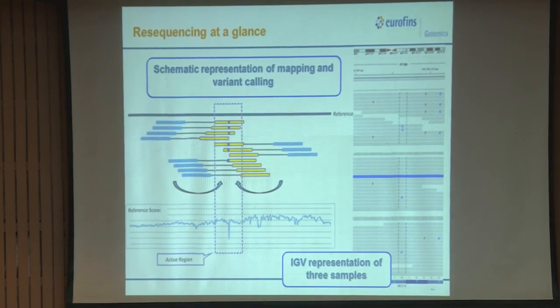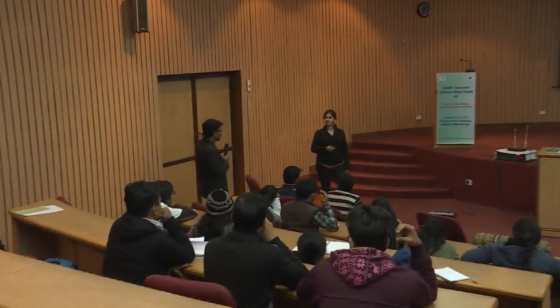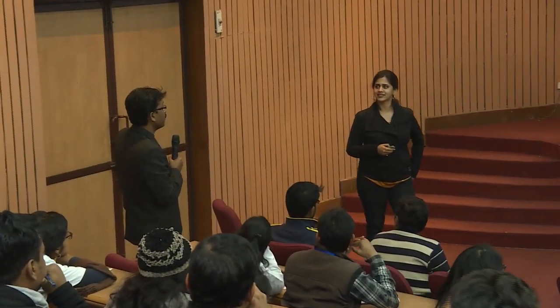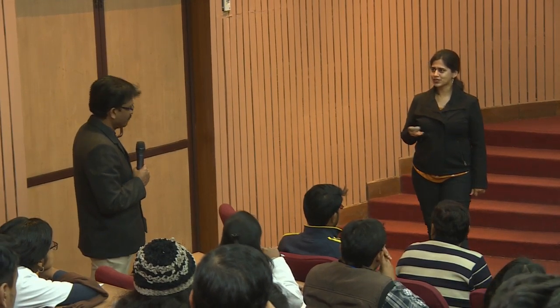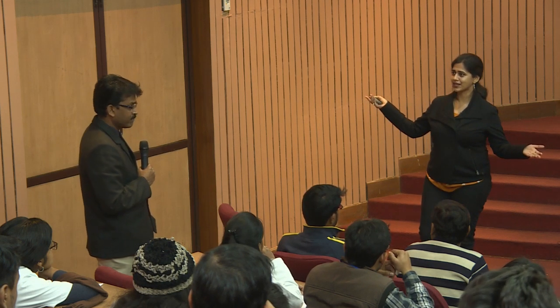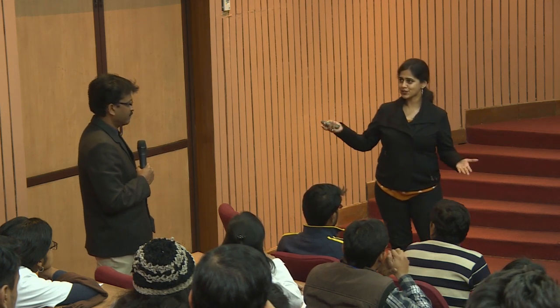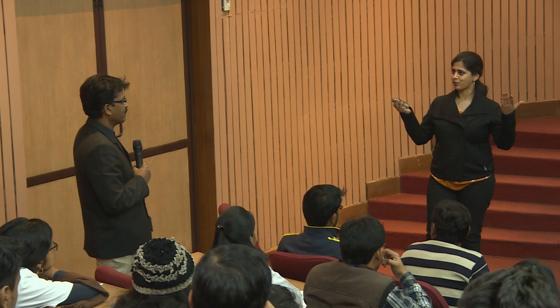I have a small question. When you do resequencing, the efforts are considerably less as compared to de novo assembly. Yes, correct. So, when you do this resequencing, which sequencing platform is ideally suited? It depends again. You can also use the short read technology. For bacteria and all, short read is good enough. You can also go for PacBio, which will straight away give you one long sequence and the entire bacteria gets sequenced. For viruses also it is a similar case, if you use PacBio, a straight sequence will come and you have a reference to map it.